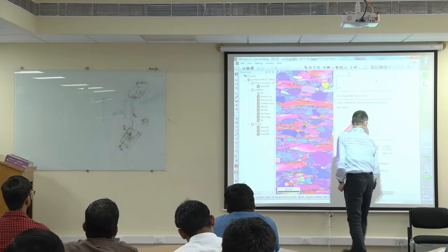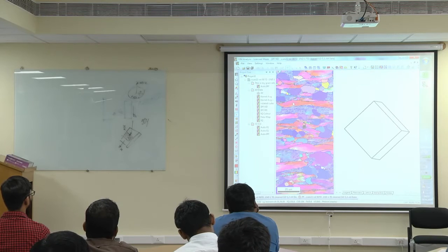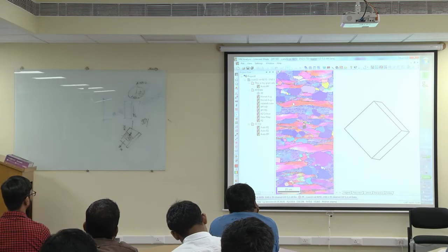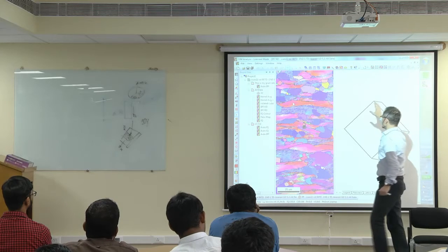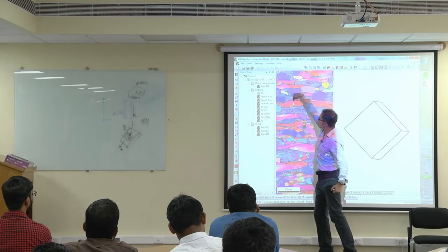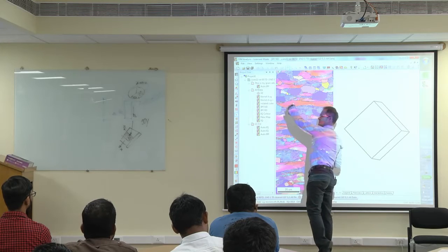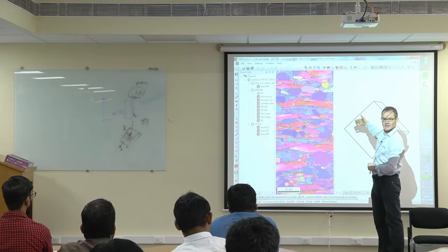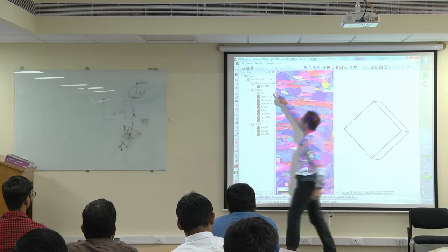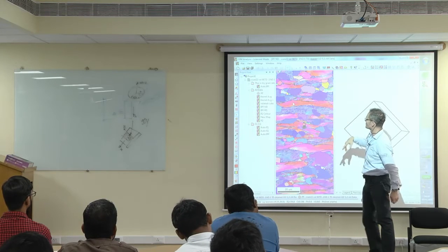That means when I now show a crystal, I can do that with the software. I can go to lattice and plot this crystal, for example, yeah? This crystal orientation for this particular grain will now correspond to the situation that I look from here on that crystal. No longer as I have measured, looking from here. No, the microscope was looking from this direction, and the crystal would have been 90 degree rotated. Now we have done this rotation here, in this case actually 90 degree around TD. Yeah, this is exactly what I showed there, so I was obviously right.